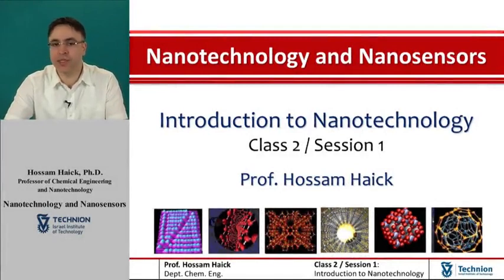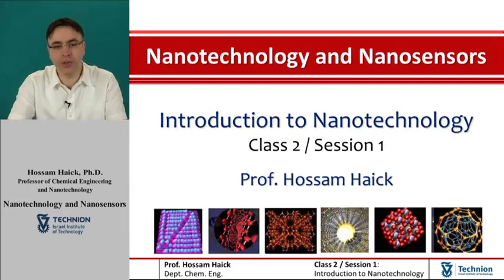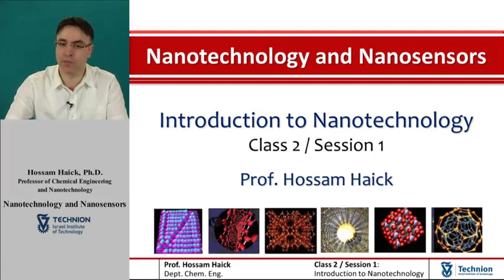In this class, we will see how scientists see what's going on in the extremely small world of nanotechnology. The microscopes that are typically used in high schools or colleges will not do the job. Therefore, nanoscientists use high-powered microscopes that use unique methods to allow them to see the surface features on the atomic scale. This way, the scientists effectively open the door to modern nanotechnology.